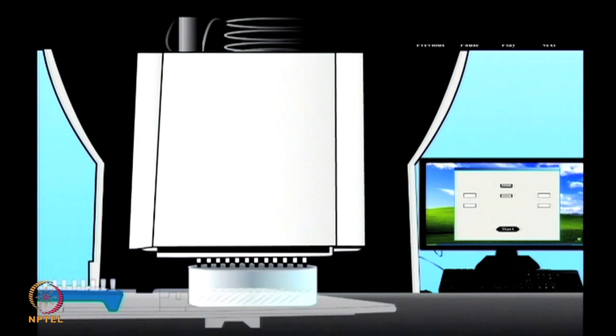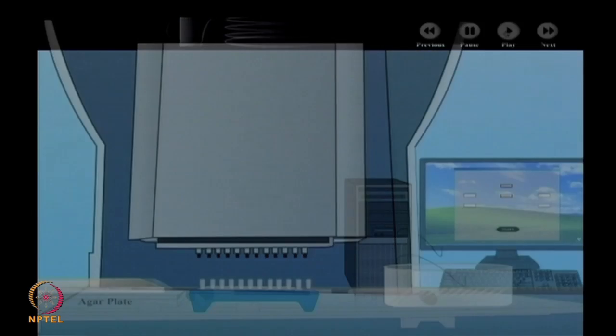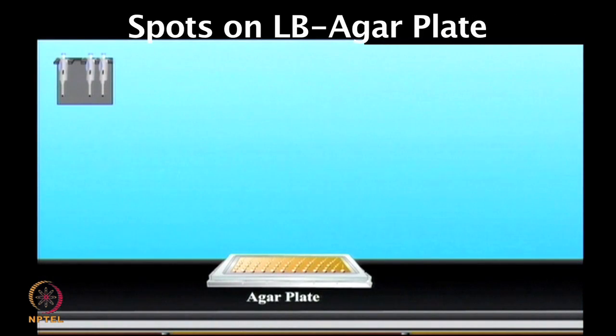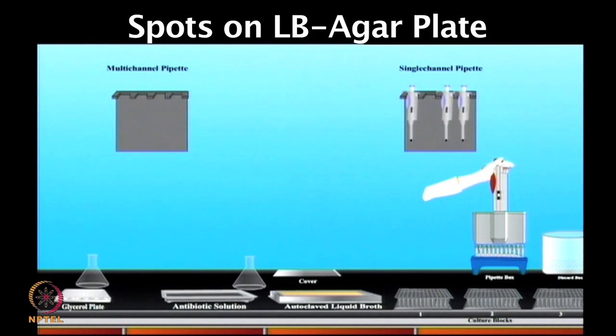It is preferred to do this in 96 well plate format, so that you can avoid any mislabeling of the samples. So, allow the bacteria to grow overnight at 37 degrees before inoculating them into the liquid medium. As shown here, you can use a multi-channel pipettor or you can also use the liquid handling system.